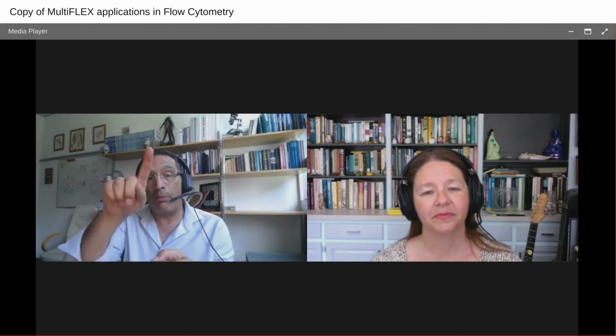How to do it? If you look at the MultiFLEX, we can just remove the lateral side. That will give us a bit more space, and instead of using the normal FACS 5 ml tubes, you use Eppendorfs. On those Eppendorfs, you can load your stimuli, your drugs, from the lateral side while the sample is running. And that means that we are speeding up the time to get your sample through the flow cell.